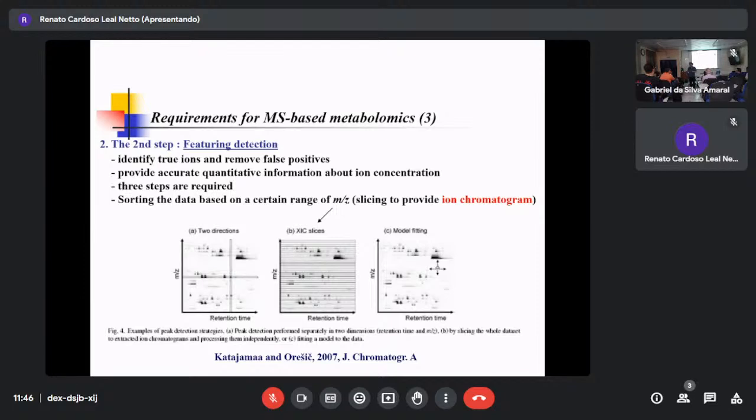So it's not the mass spectrum. There is some scandal or episode in Japan around 1978. There is an NMR instrument. Every day, they measure. Most signals come out around 100 ppm. They measure this sample, they measure another sample.